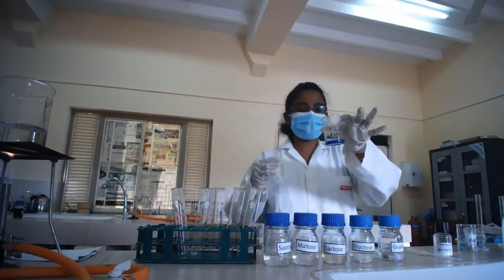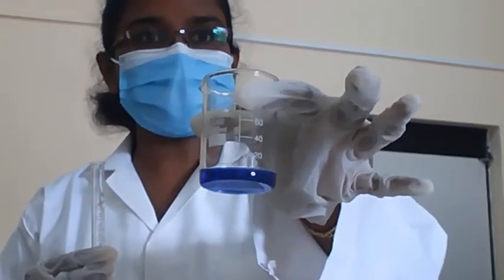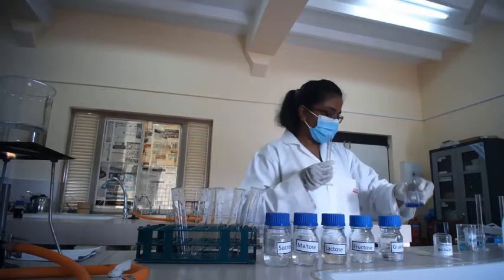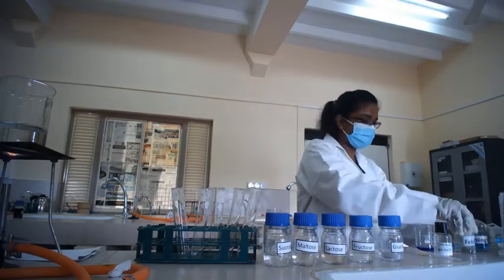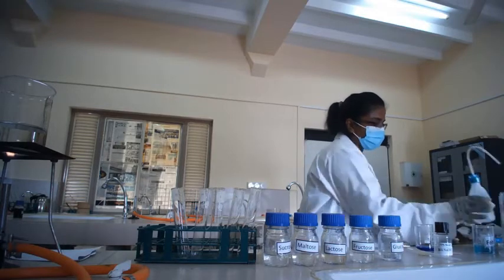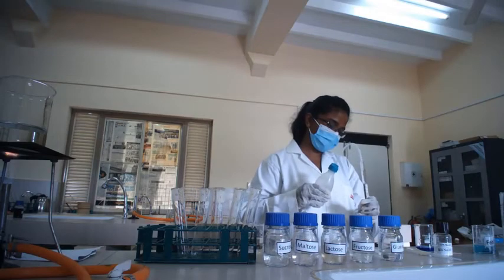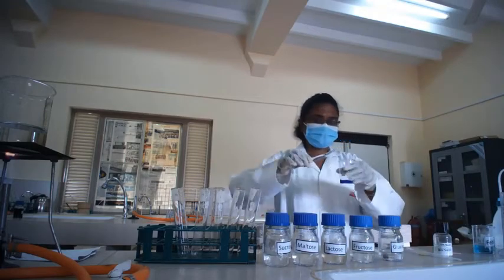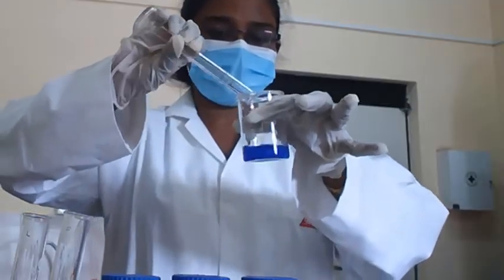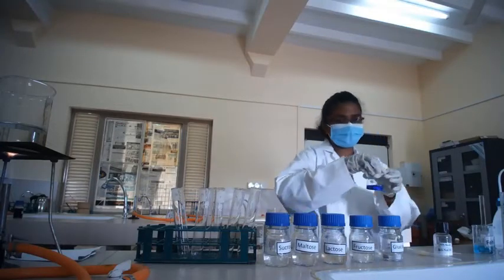As you can see, it turns into a Persian blue color. Then we are going to add 10 milliliters of distilled water. This is our Fehling solution.